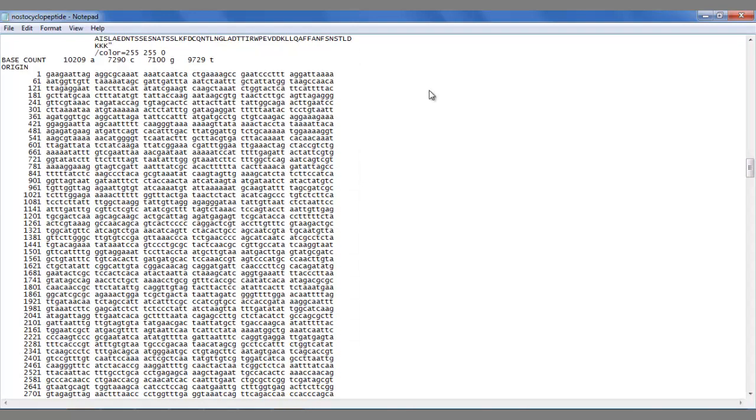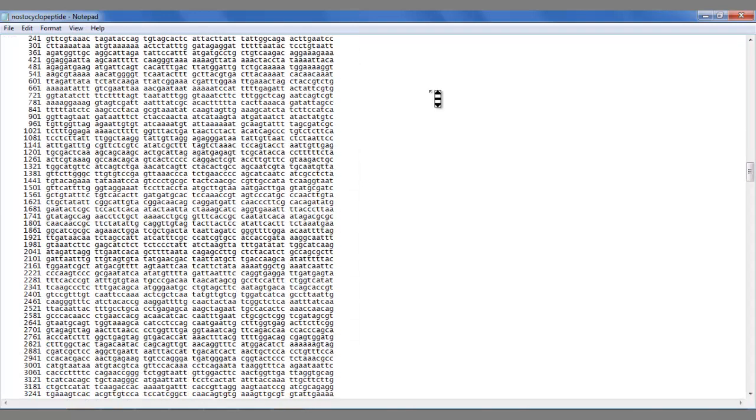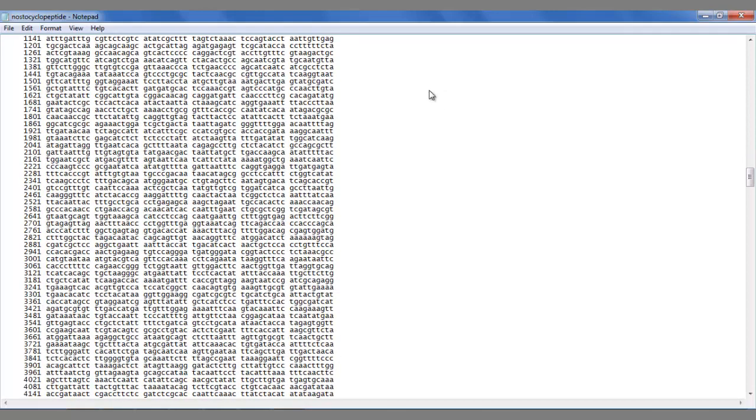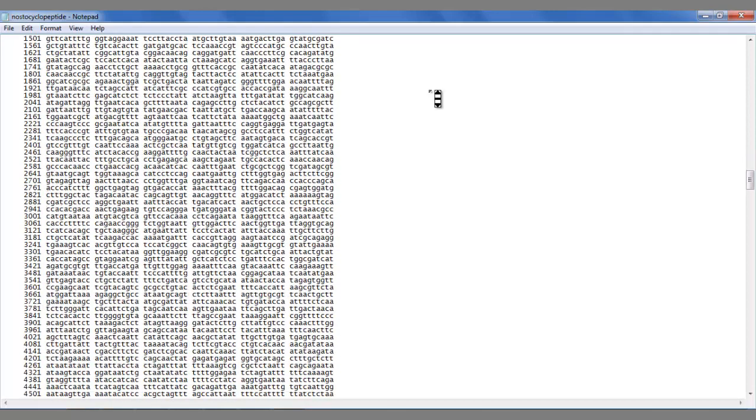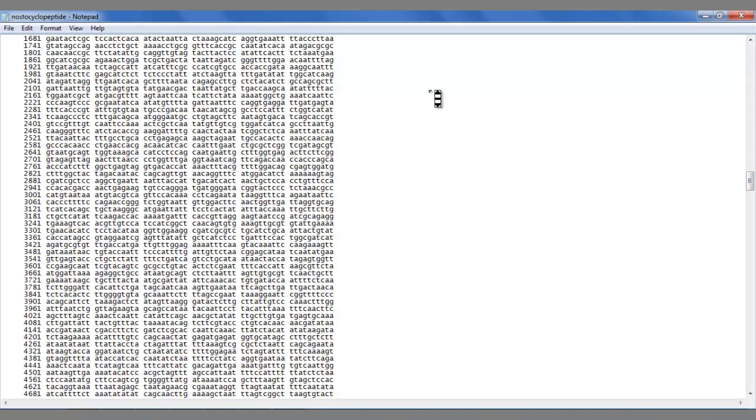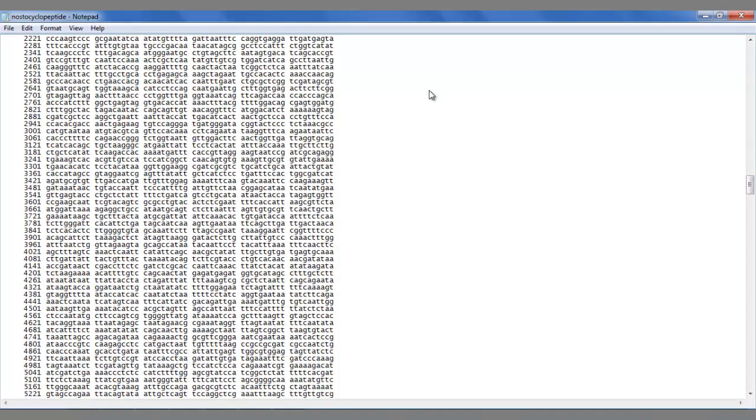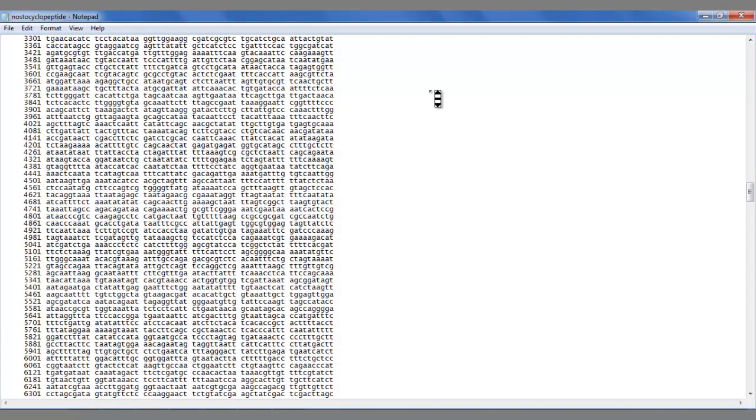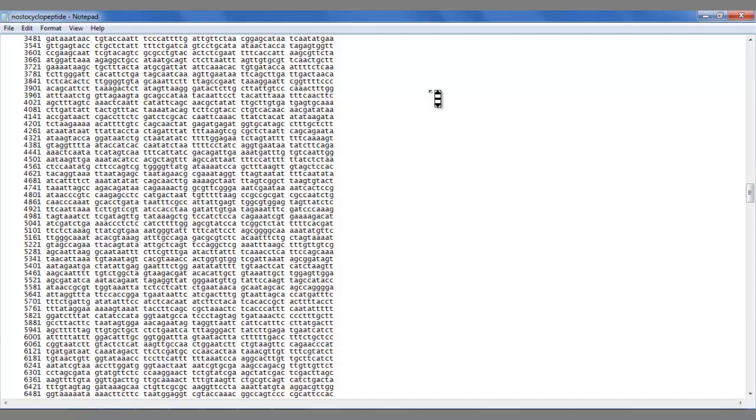In this instance, we're going to use a non-ribosomal peptide synthetase called Nostocyclopeptide. As you can see, there is a lot of information, but we don't have to think about that too much at the moment.